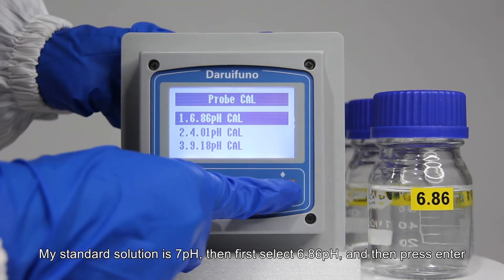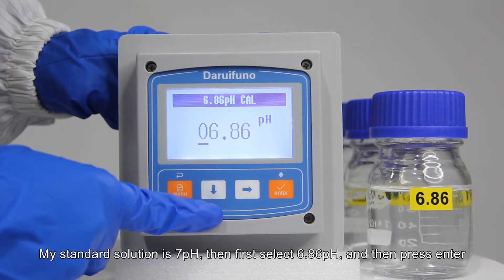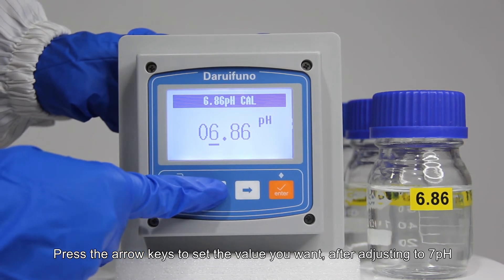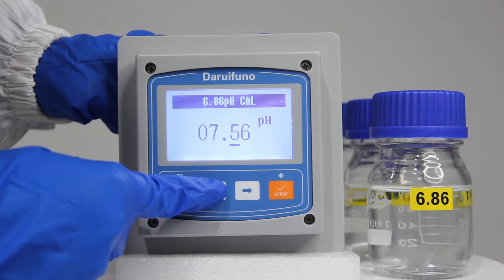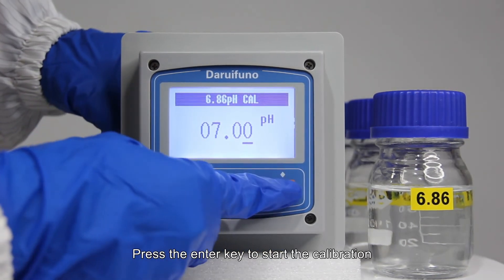For example, if my standard solution is 7 pH, first select 6.86 pH and then press enter. Next, press the arrow keys to set the value you want. After adjusting to 7 pH, press the enter key to start the calibration.